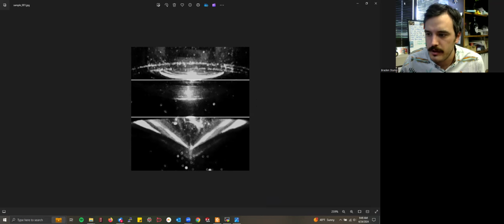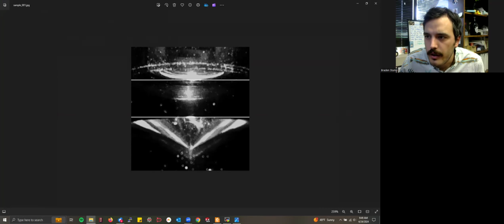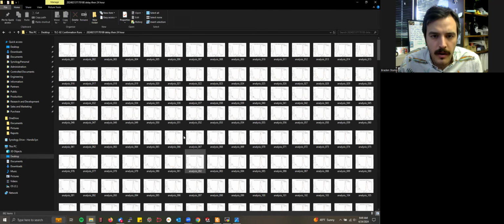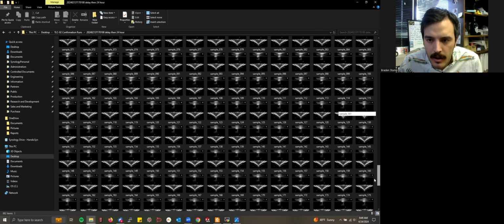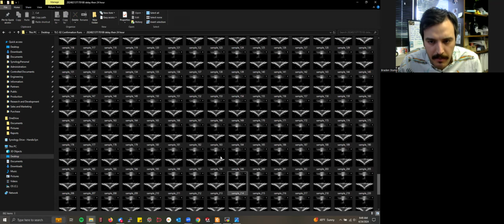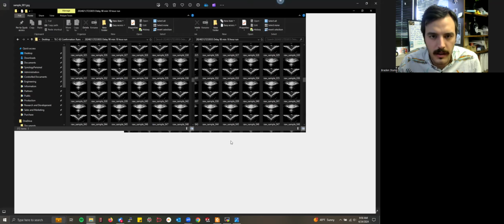I can also pull some, I'll look and see if I can find any good examples here on my desktop of how TLCs have performed. Perfect. This is a 24-hour run. So I can, one moment. You can see sample temp, sample level staying pretty well consistent there. Let's see, I can grab an 18-hour run here. This is another really good example.